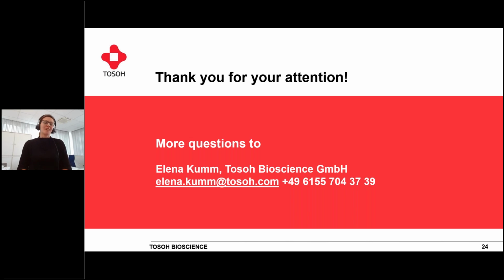Yep. This is quite a big, broad question: how would you start to develop a method on an ion exchange column? I totally understand where this comes from, because I know this. You just don't know what to do in the beginning. I would say, maybe you know what you would like to analyze, so you know your protein of interest.